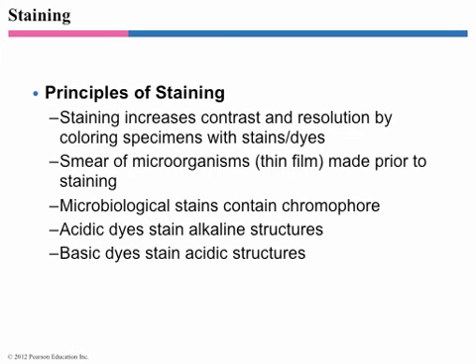The vast majority of stains that are used in biology are basic stains or basic dyes. And in this case, basic doesn't mean simple. A simple stain is something that we're going to talk about in a second. But a basic stain or a basic dye means that it is not acidic, that it's alkaline. It has a pH greater than 7.